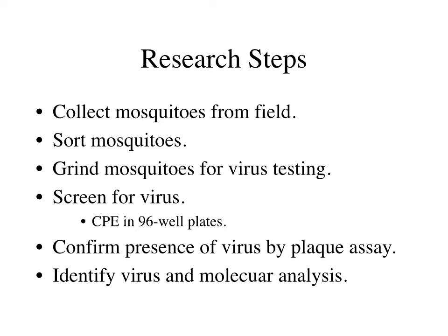But what we would want to do next is confirm that the CPE was actually caused by virus, because there are many things that can cause cells to die off, various kinds of toxins and things. So we wanted to confirm that it was actually virus, so we did plaque assays.